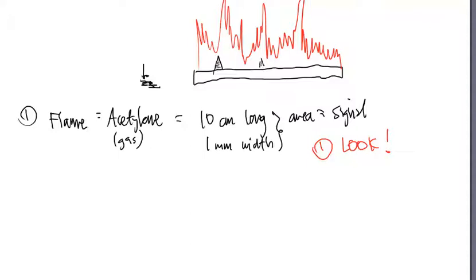And if we start seeing these splits in the burner head where flame is not really coming up from it, then this is bad news. So you don't want splits. You want to get rid of those. Now, the reason that those appear is because your burner head is getting stopped up. So look at your flame.